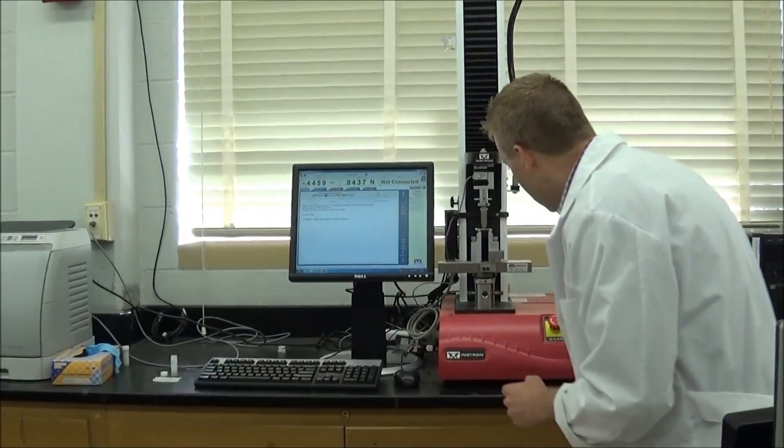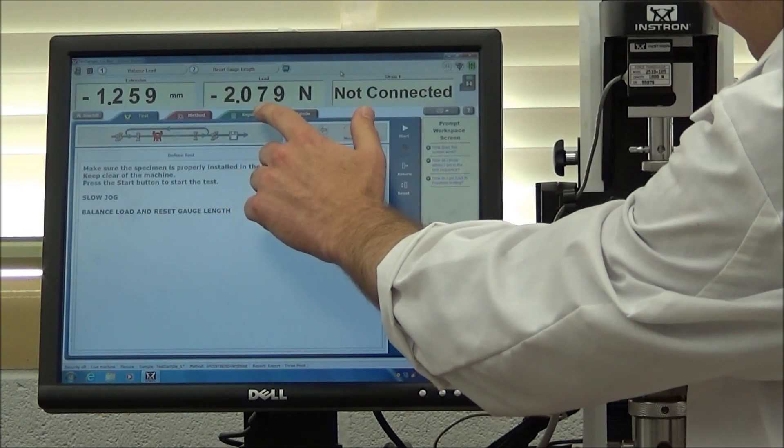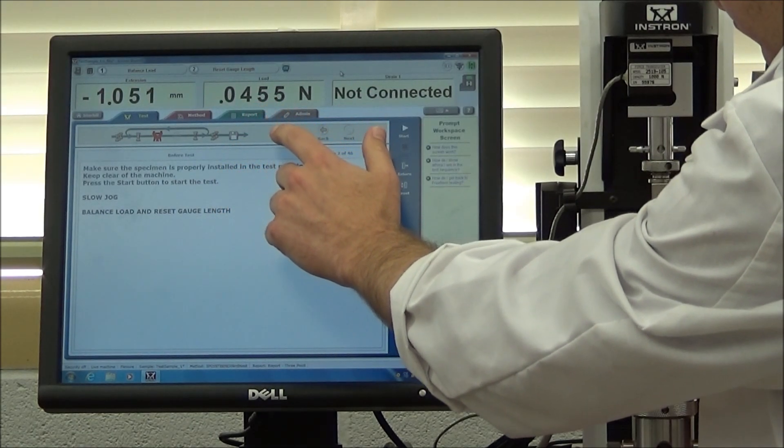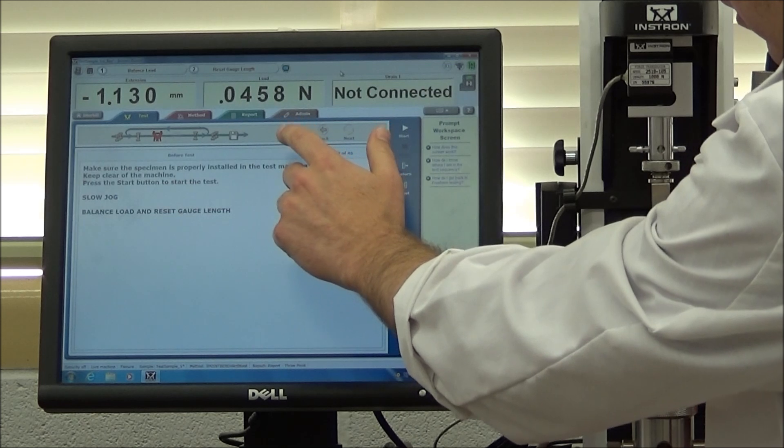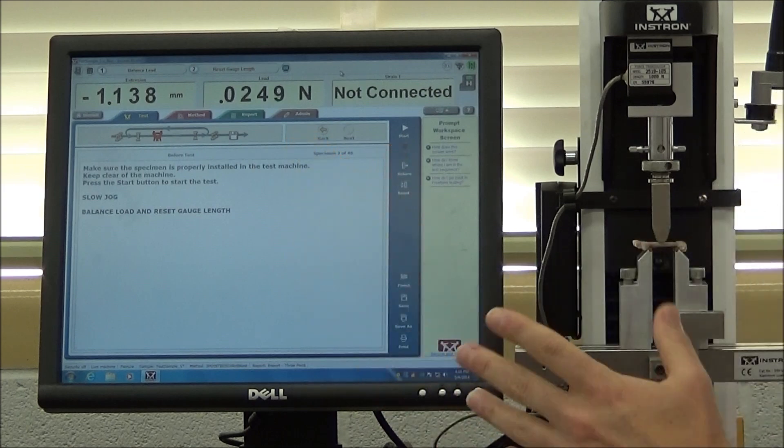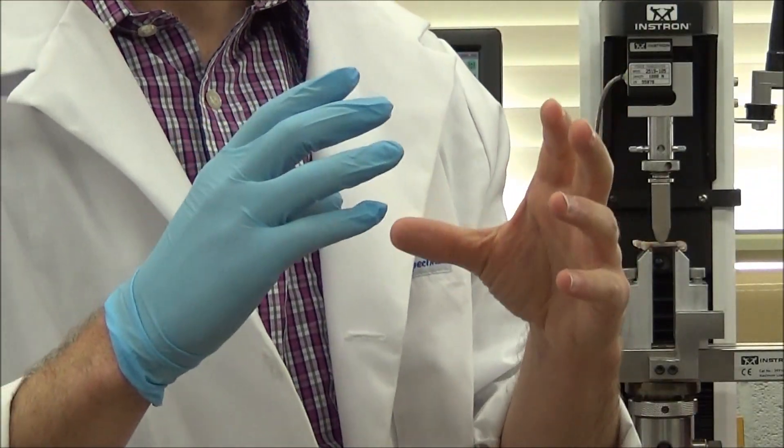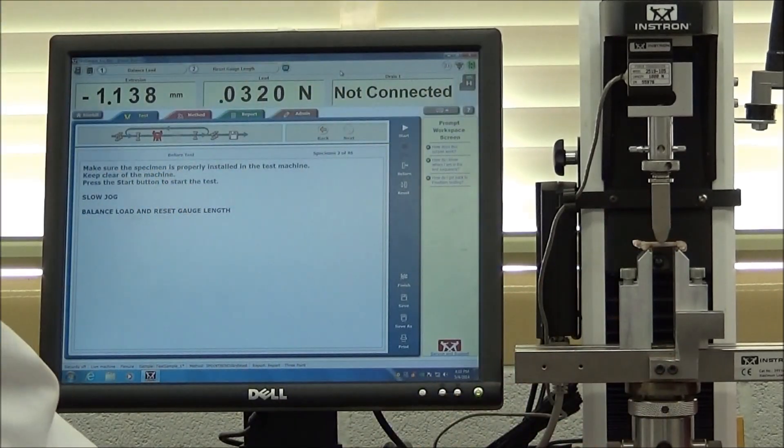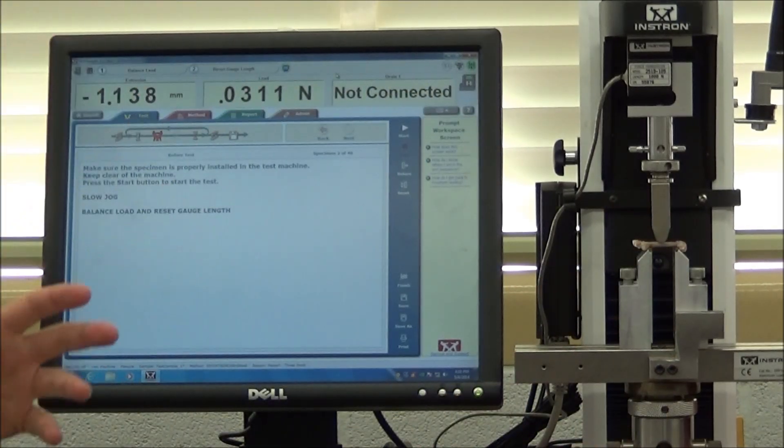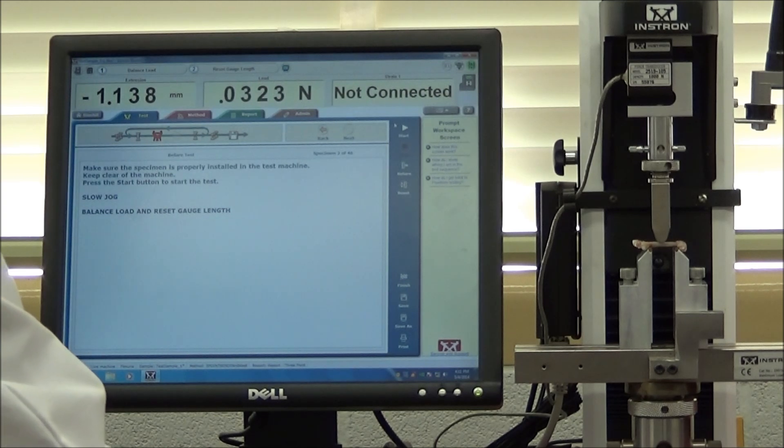So if we go ahead and zoom in close here, we're going to preload this bone to just the slightest bit of preload, about 0.1 newtons. What this does is it just settles the bone into the testing machine. All right, we'll go ahead and run the test. I've already input all the parameters, all the dimensions, and all the lengths and the diameters and everything. So we'll just go ahead and run this test.